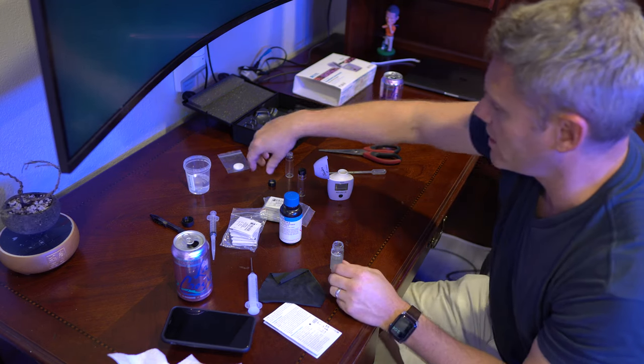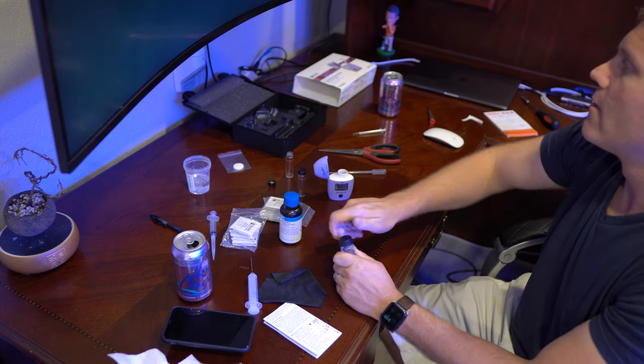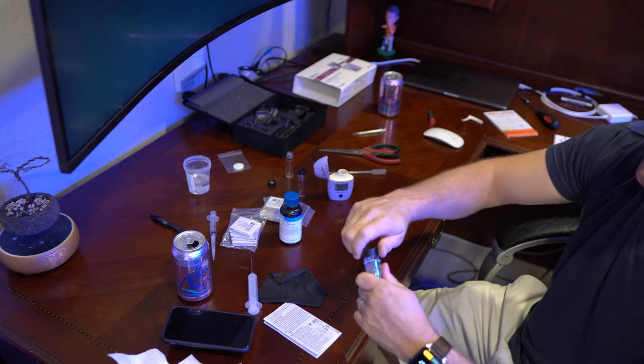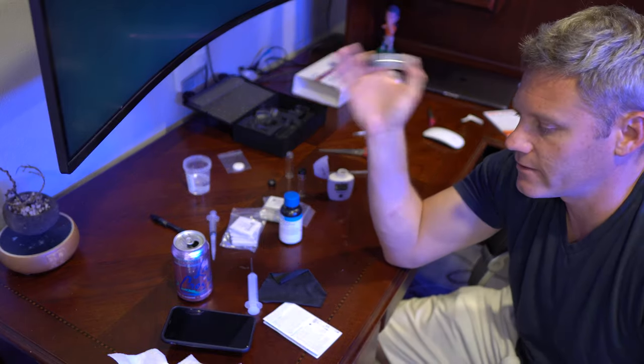Put the cap on and shake for one minute. Don't shake for fifty seconds, don't shake for a minute and ten seconds — exactly one minute. I like to use a timer so I know when to stop and I don't have to sit there watching. Just shake until I hear the timer go off.